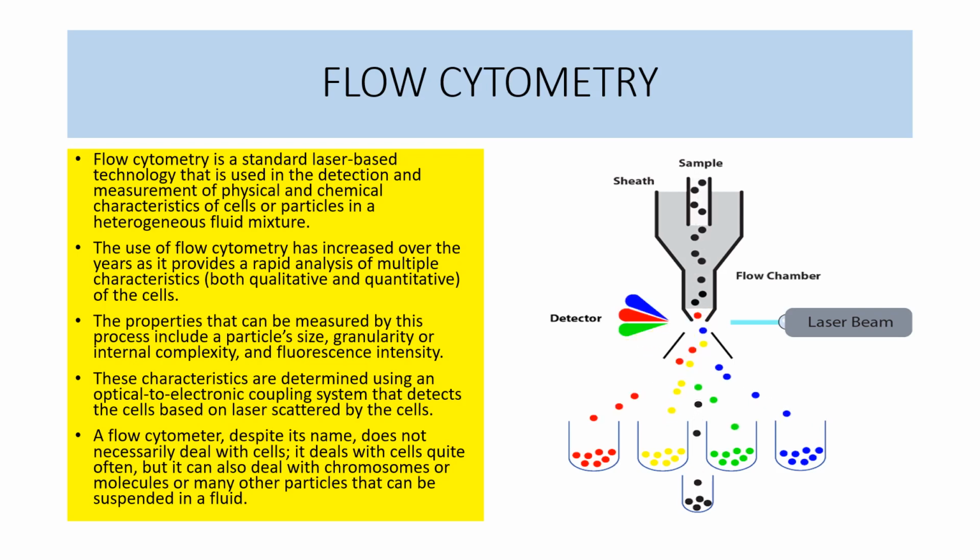The properties that can be measured by this process include the particle size, granularity or internal complexity, and fluorescence intensity.